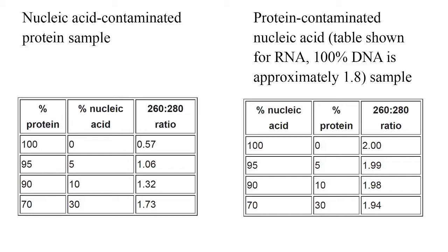Finally, I should state that contamination of protein sample by many substances can significantly induce inaccuracy in measurement of protein concentration by this method. Thus, this method is most suitable for pure protein samples.